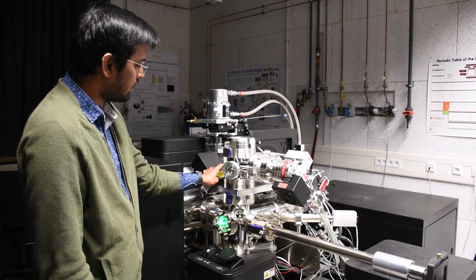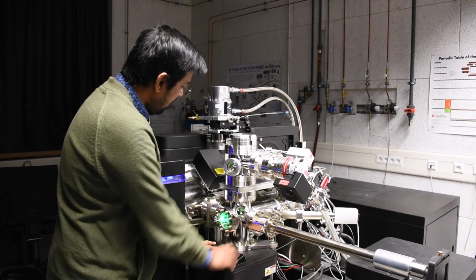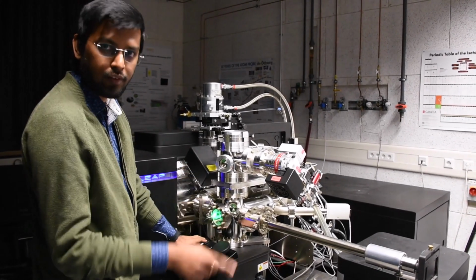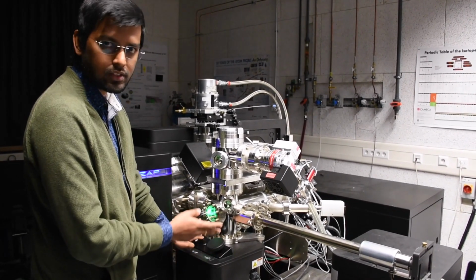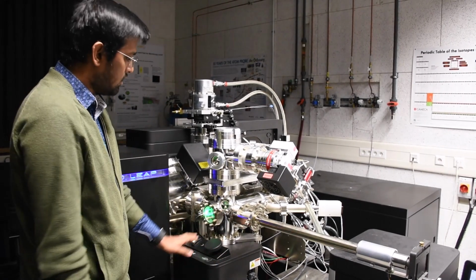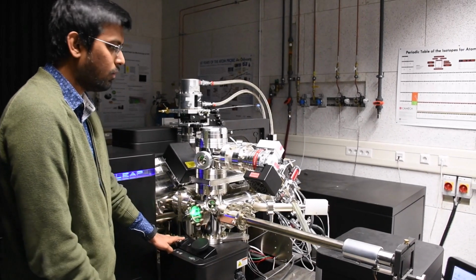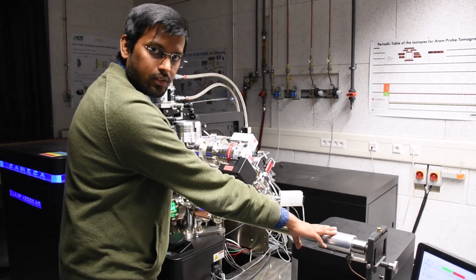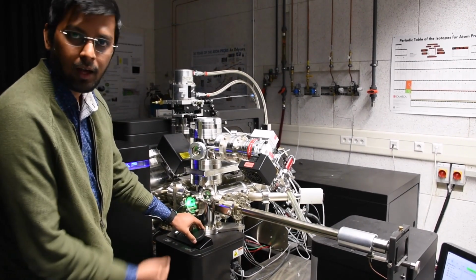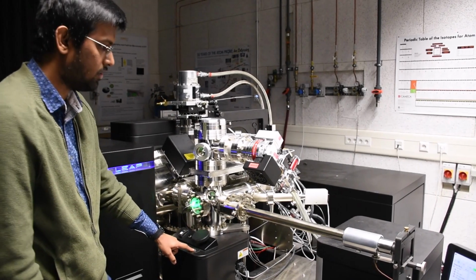So we moved our sample from the load lock to the buffer chamber. Now the load lock carousel itself was moved to the buffer chamber using this vertical manipulator. And now we are going to move the sample from the load lock carousel to a buffer carousel. So we have another carousel because we don't want to expose the buffer carousel to the atmosphere. So in order to move the sample from the load lock carousel to the buffer carousel, we will use this horizontal manipulation rod, while controlling the movement of the carousels themselves using the vertical rotation of the manipulation rod.